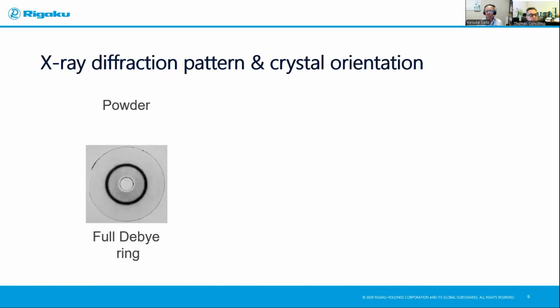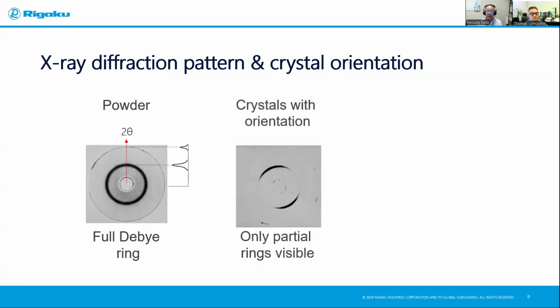In the last episodes, we learned about powder diffraction. If your sample is in powder form, your crystals don't have any preferred orientation, so you can scan in any direction relative to your sample surface and get all the necessary peaks to identify your crystal. However, once a preferred orientation is introduced, depending on which direction you scan, sometimes you see a strong peak, sometimes a very weak peak. By the way, those are X-ray diffraction images taken by photograph.